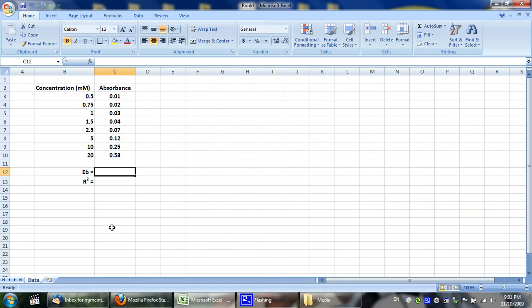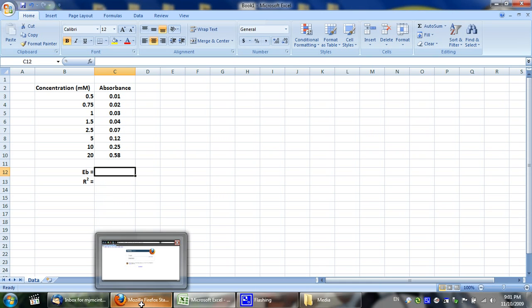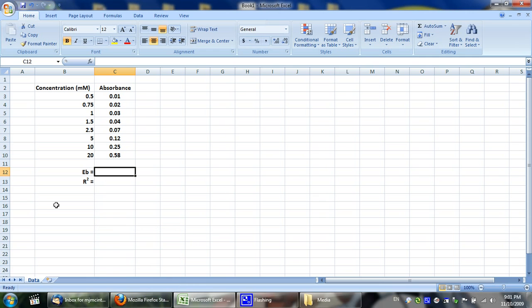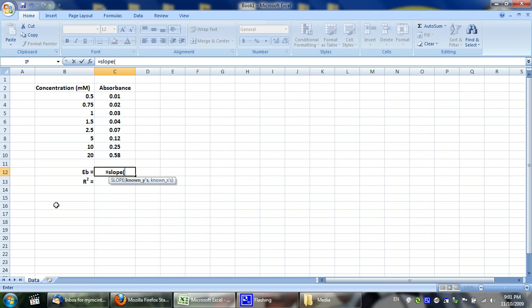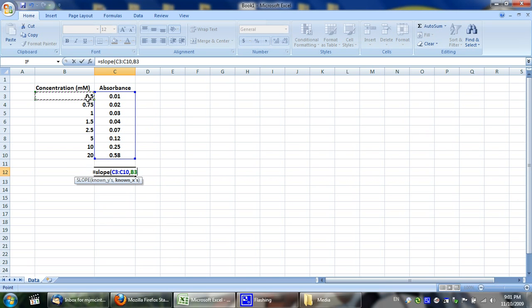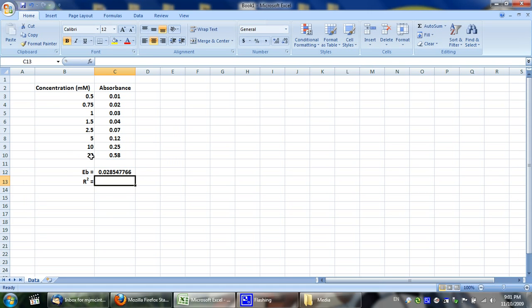With these values, you can get the slope — which is EB — by entering the formula: equals SLOPE, then you select the range of your Y values, comma, then the range of your X values, and press Enter.